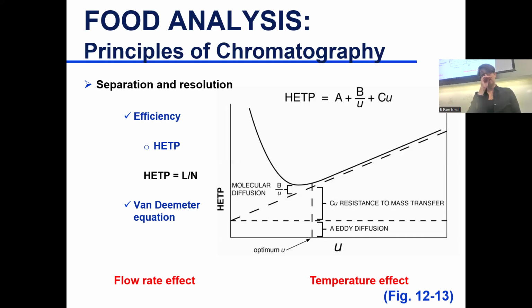Well, the separation you need of one of these micro capillary things that's a meter long, how big would you need if it was 5 inches? So the size, if you have a lot of compounds that are very similar in their molecular structure, if you have a short column, you don't give them enough time to separate. If you wanted the same separation with a capillary column as you have a 5-inch column, probably thousands of. Don't worry. The 5-inch will never.